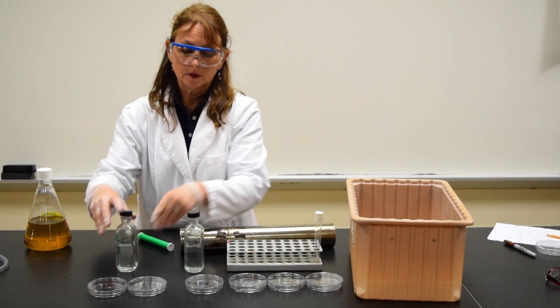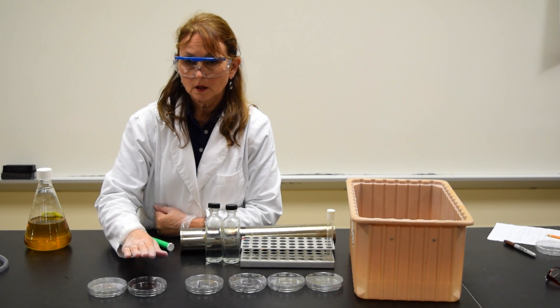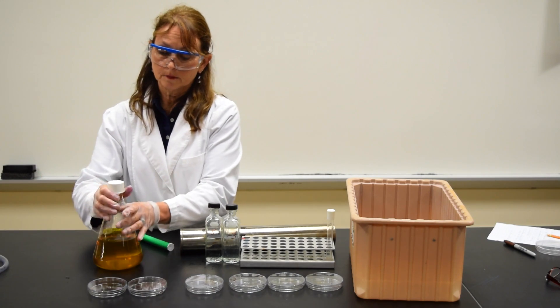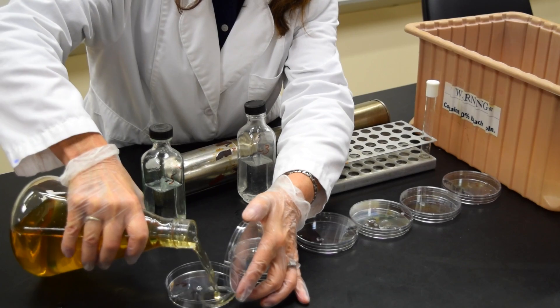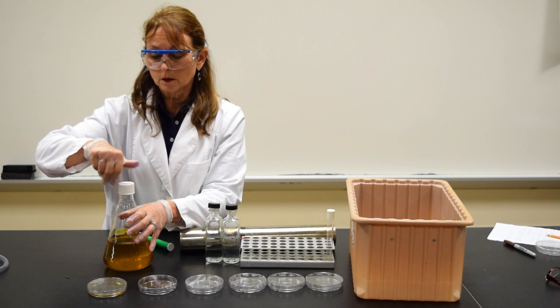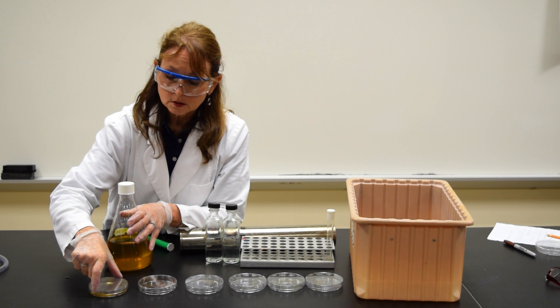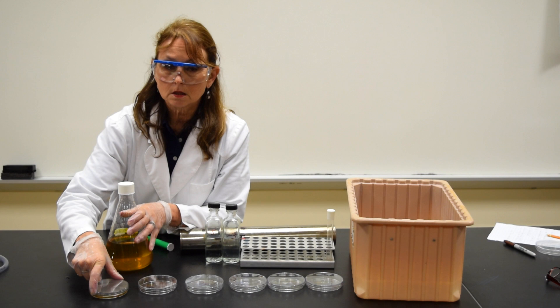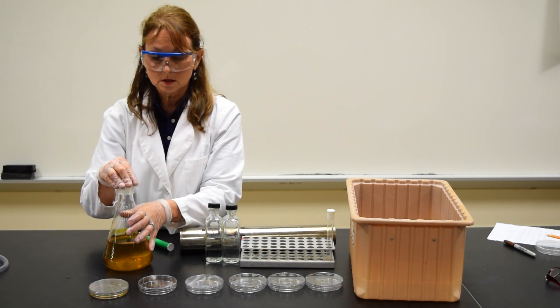Discard the pipette in the dishpan. Since this is a pour plate method, I put my sample in the plate first, and then I add my culture media. I would add culture media to each of the plates. Make sure you cover the complete bottom of the plate, and don't forget you need to mix the culture media with the organism so that they're evenly dispersed throughout the plate, making it easier to count in the next lab period. I would continue adding the media to the rest of the plates.